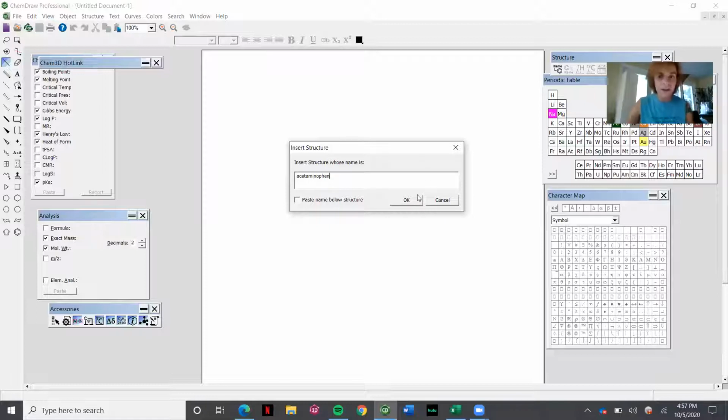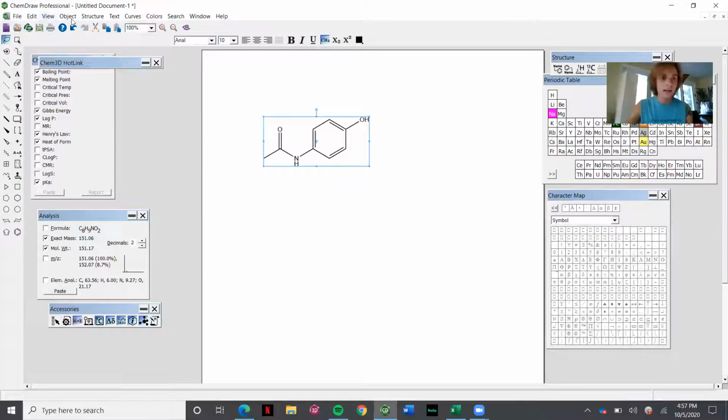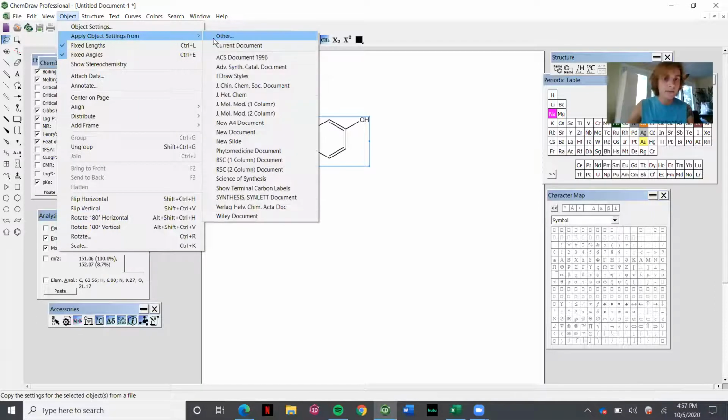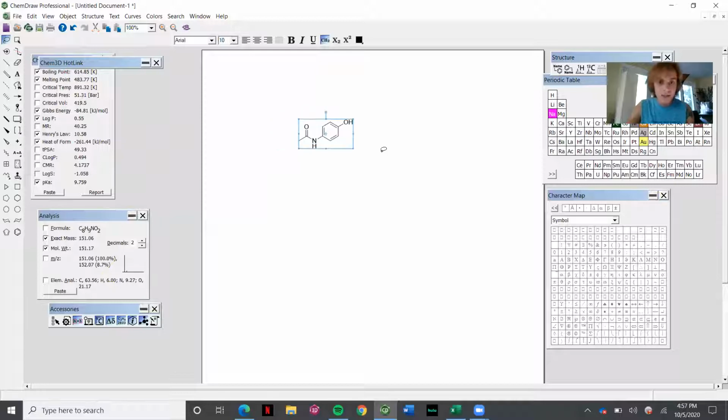Let's hope I typed that out properly, and I did. And here we see Acetaminophen, exactly as it should look. So we have, and this is the most important part of this entire lecture, because most of your questions do pertain to the polarity of certain functional groups.